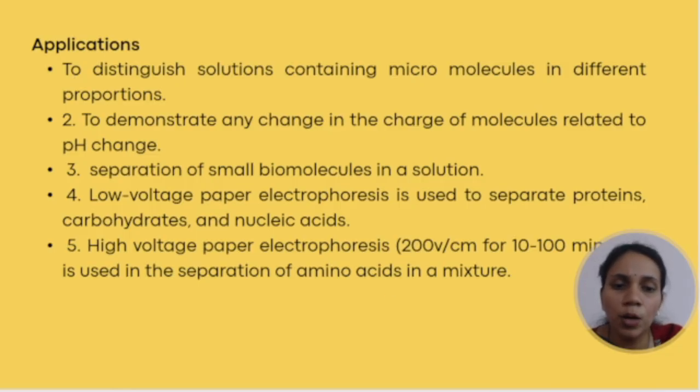But before we move on, I would like to discuss some of the disadvantages of this particular paper electrophoresis. The problem with this is it is low resolution. It is going to give you a low resolution result which is not acceptable at a scientific level, because especially these techniques are used in your laboratory, and people who are working in the laboratory are looking for results, right? These results may be with the viewpoint of some work they are doing and which they want to publish. So definitely you need to give good resolution images, good resolution results.